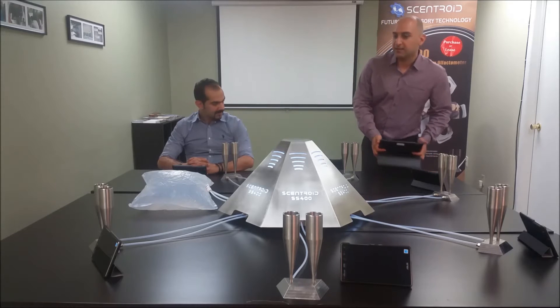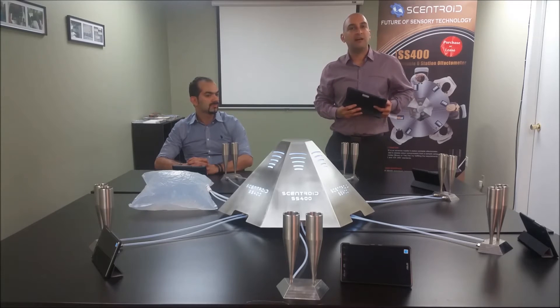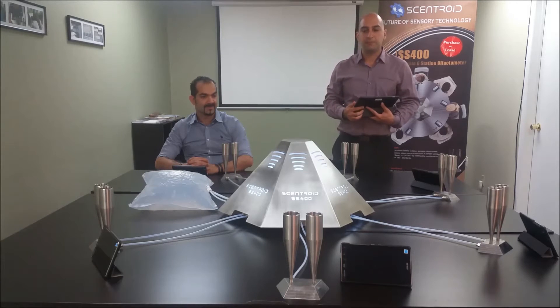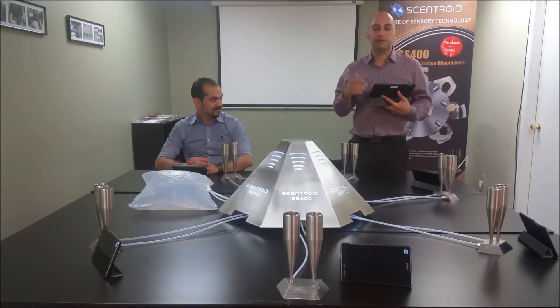The unit itself — the dilution and everything — happens inside this pyramid. Within it are all the valves, all the stainless steel and Teflon tubing and dilution apparatus. We connect with the administrator tablet to the pyramid through remote Wi-Fi.